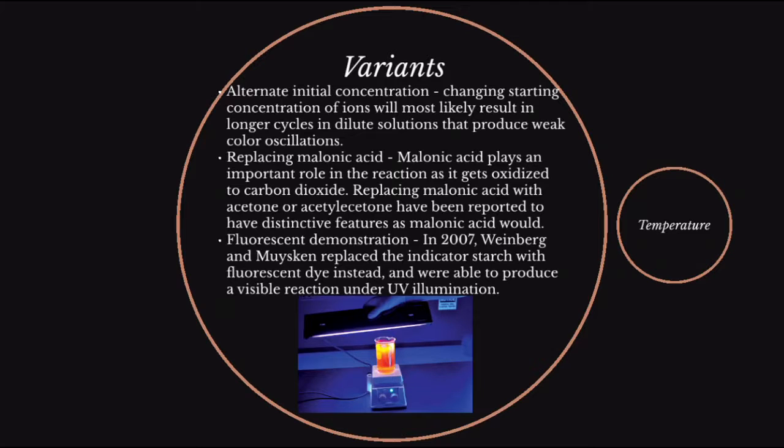Replacing malonic acid with acetone or acetylacetone has been reported to produce distinctive features just as malonic acid would. And fluorescent demonstration: in 2007, Weinberg and Muskin replaced the indicator starch with a fluorescent dye instead, and were able to produce a visible reaction under UV illumination.